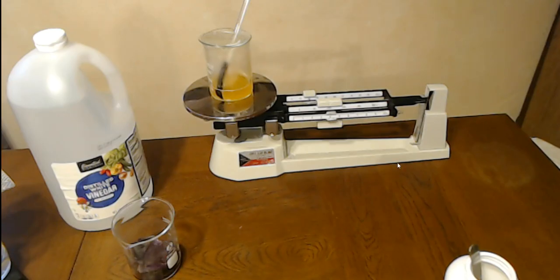It heated up. One of the reasons we put the watch glass on top is, if you'll notice, it's kind of cloudy here now. Because it heated up, the water vaporized and it hits the cold glass around the outside and condenses back. Same with the cover slip on top, so that tries to keep some of that vaporization of the water from escaping. So might be good to record that just in case.